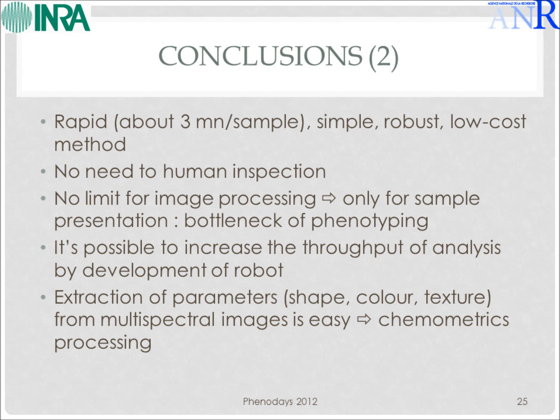To do that, we don't need to have human inspection, and we have no limit for image processing, but we have the limit of the sample presentation, which is the bottleneck of phenotyping in general. So with this method, it is possible to integrate it in a robot, and in this case, it will allow to increase the throughput of the analysis.